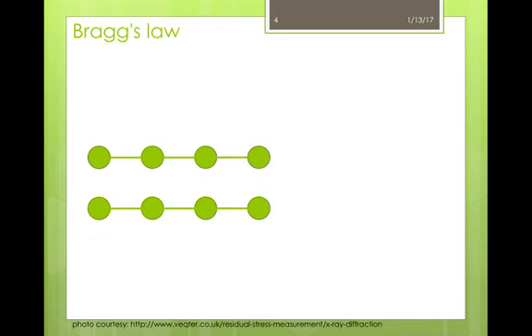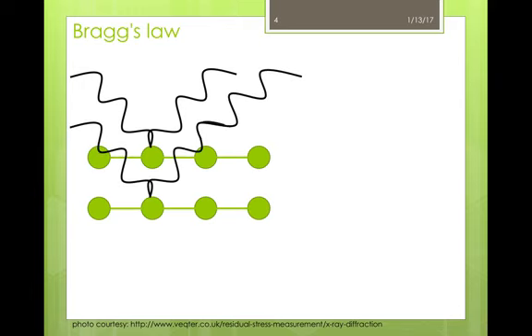So how does XRD actually do this? The best place to start is Bragg's law. Bragg's law is used in defining a material using X-rays, which have very short wavelengths on the scale of an angstrom, and these are aimed at the sample. When the X-rays hit the atoms in the sample, the path of the X-rays is altered. In 1912, W.L. Bragg discovered the relationship between the wavelength of an X-ray and the angle of diffraction and the distance between the internal planes of a crystal.